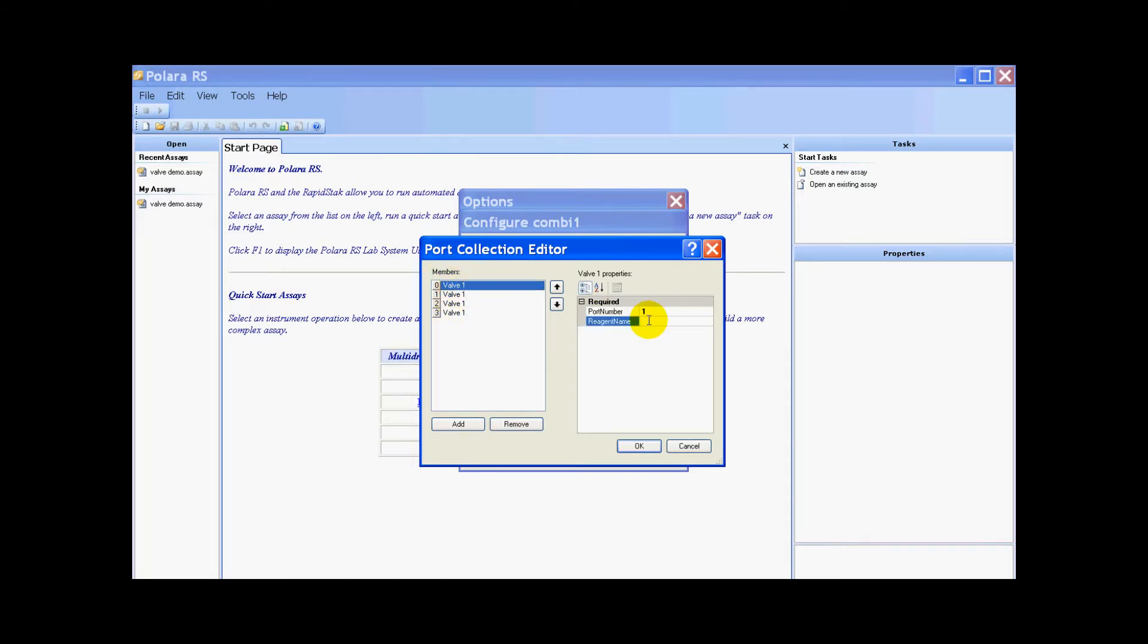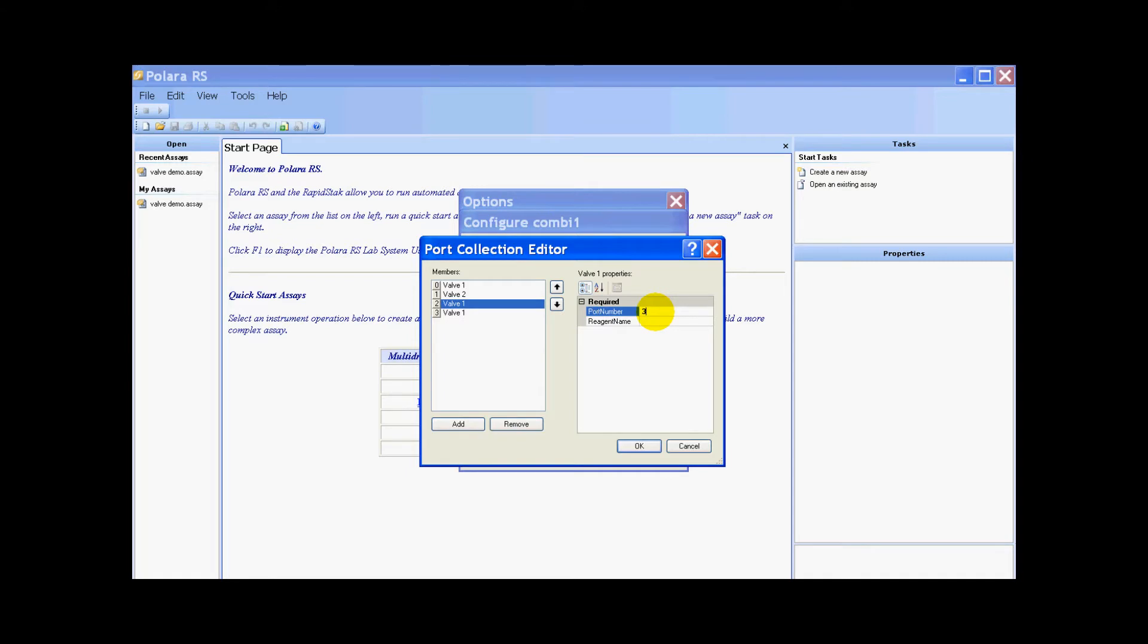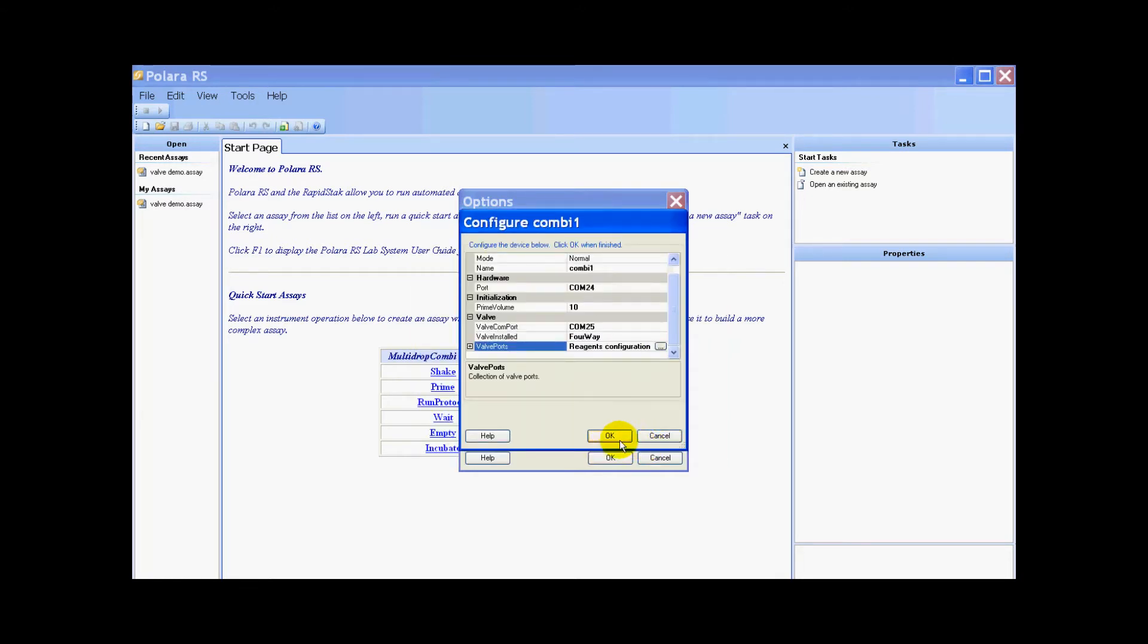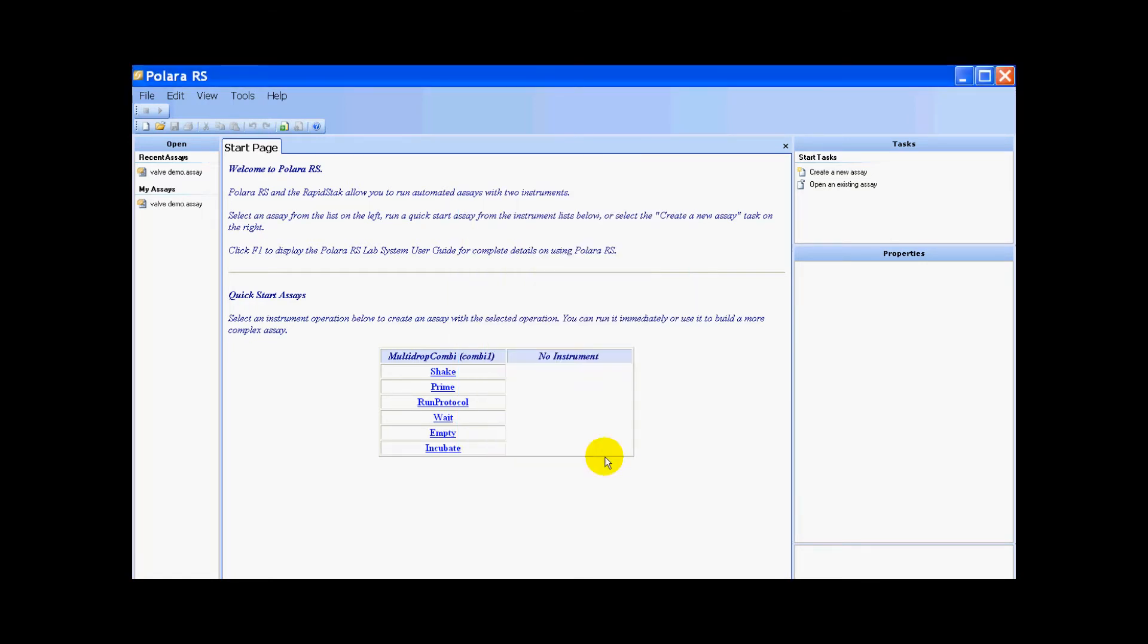Valve one, I'm just going to have reagent one. Then I'm going to switch this to valve two, and this will be reagent two. I'll do valve three, this can be water. And then valve four, I'll just say reagent three. I just hit OK, hit OK for the configure combi one, and hit OK for the options.